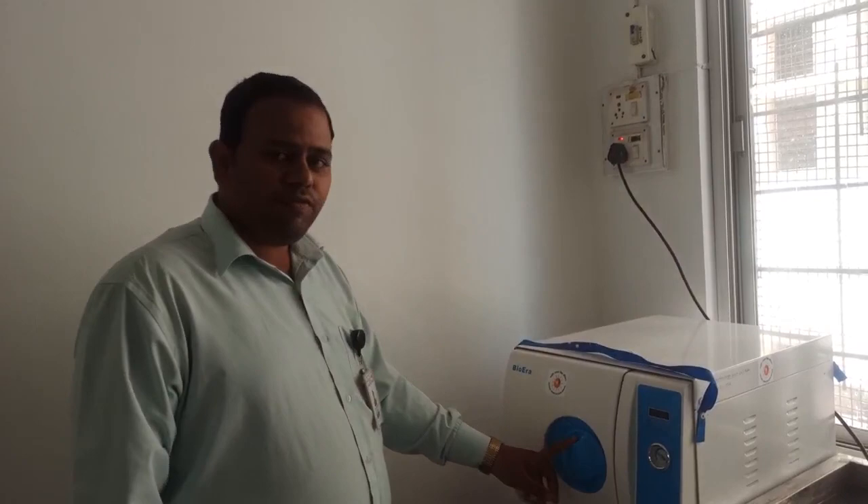Welcome students, welcome to the biological life sciences channel. Today we are going to see how a digital autoclave works. This is a Bio Era digital autoclave, and we are going to see its working and how the working of this autoclave is done.